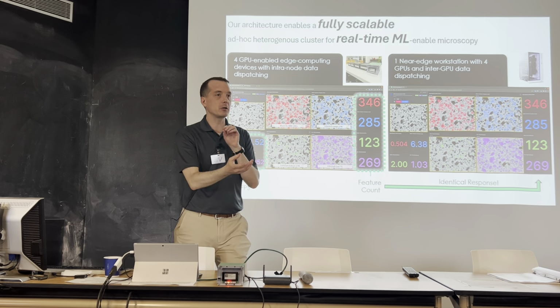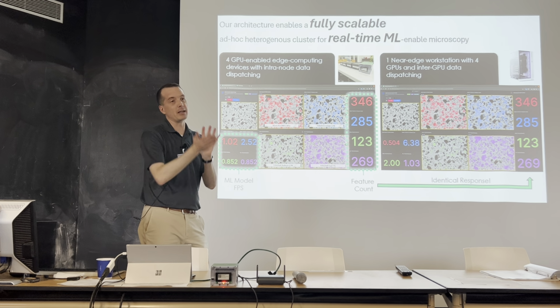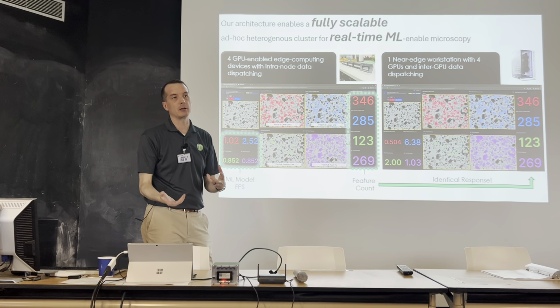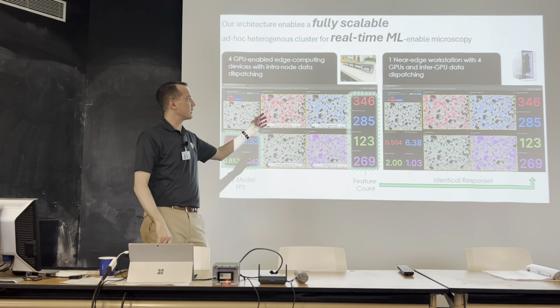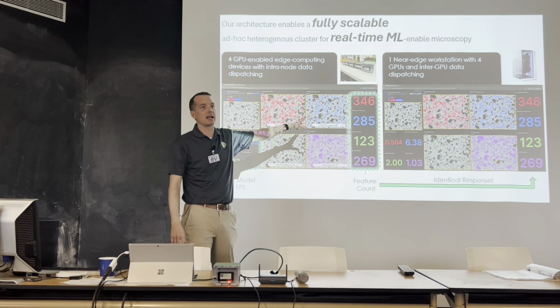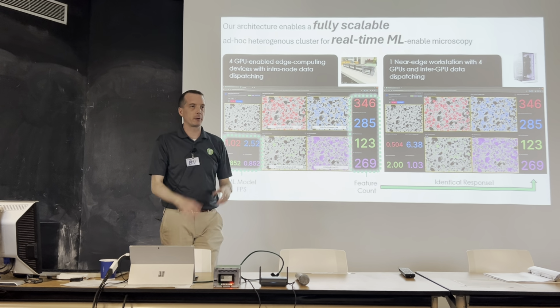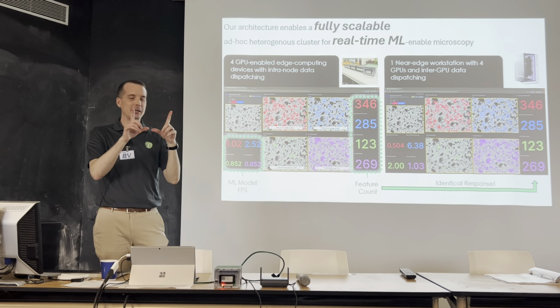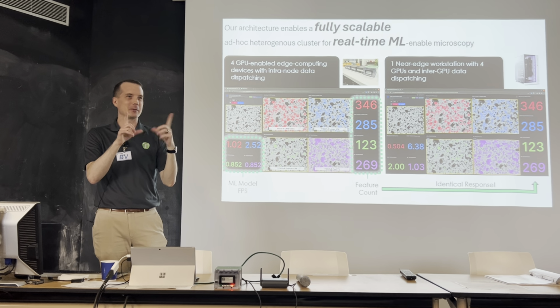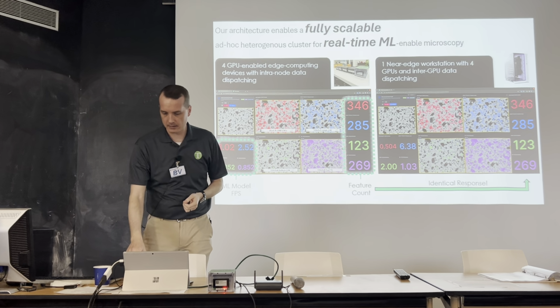So you basically use another dimension to look at that, or another analytical technique. Another one that they use in this case is EELS, and they'll have that on the microscope, and they can use that to identify and say, oh, this region is what it's looking at. Grain boundary is important because the EELS data looks a lot like the grain boundaries, and we say, hey, does that work? It kind of does work for that too. It's pretty interesting.